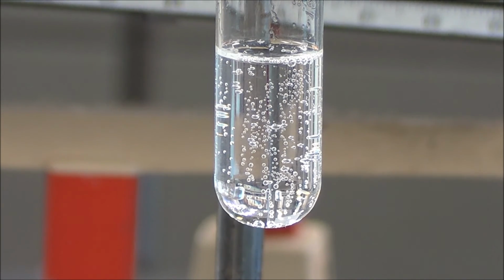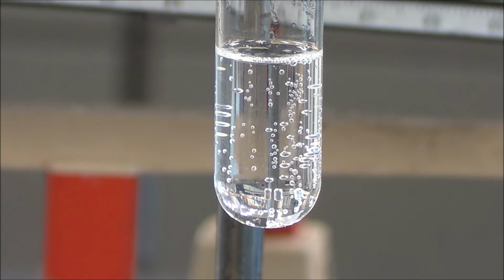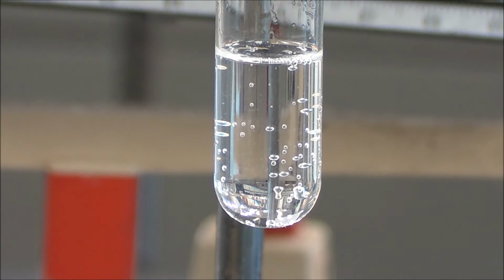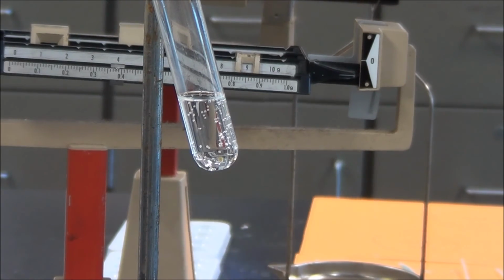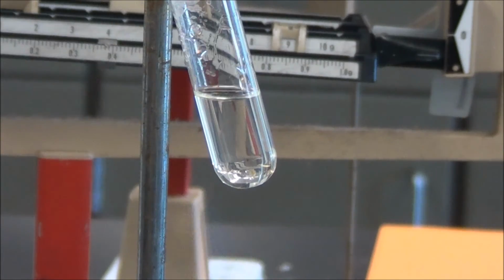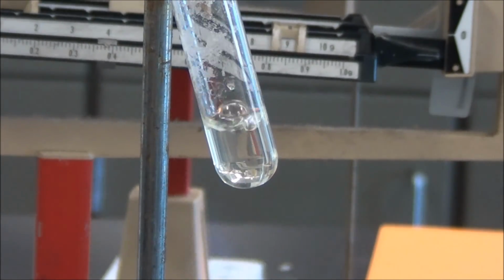What happened to the carbonate ions? It's gone. It's now part of water, and it's carbon dioxide. And every little bubble that you see go up to the top means more and more carbon dioxide leaves. So I did not start heating it until I noticed that all the carbon dioxide bubbles were gone. As I heat it, of course, the water boils away, leaving behind the salt.